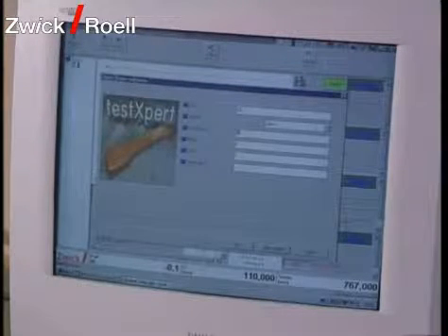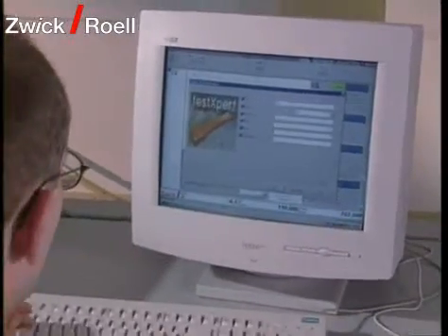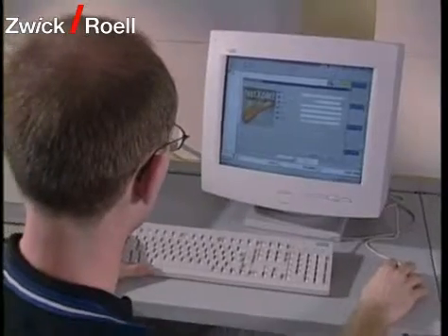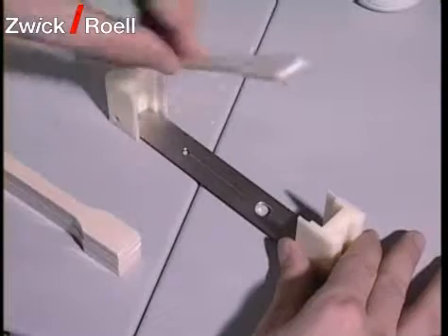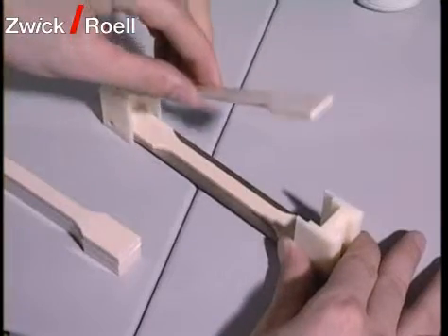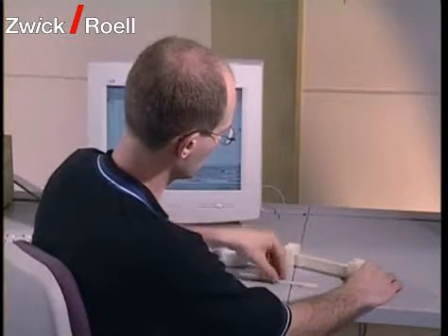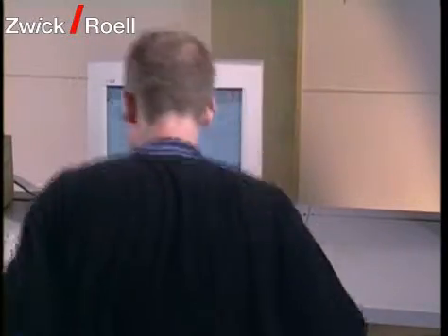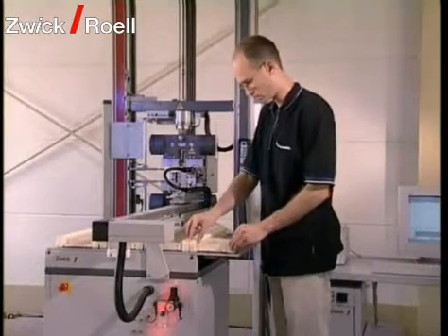The operation of the test system is very simple. The operator stores the test-relevant data of the specimen in a data file, then places the specimen in the specimen carriers. Plastic specimens are magazined in stacks. The specimen magazine is variable and adaptable to the customer-specific specimen geometry.